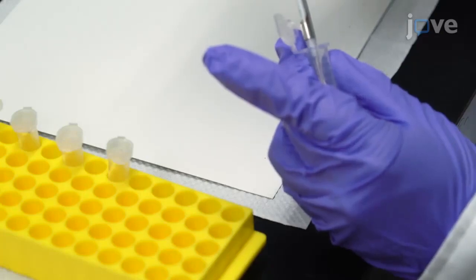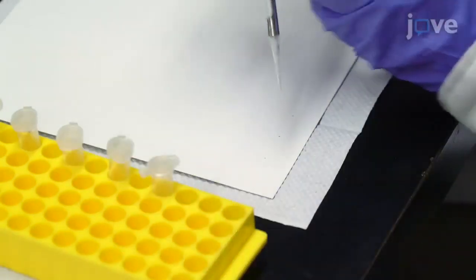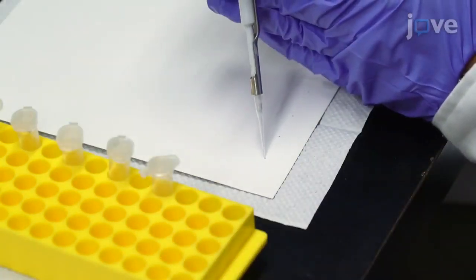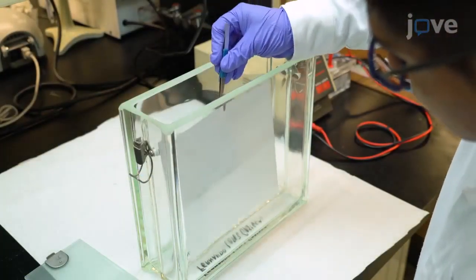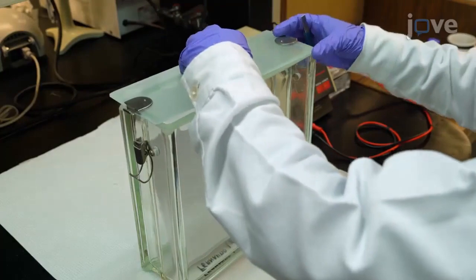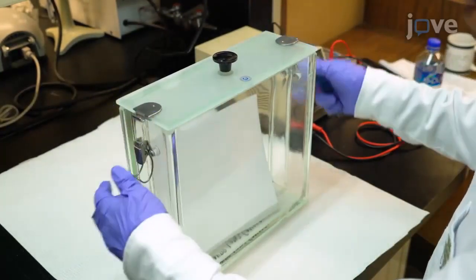First, apply 1 microliter of the previously prepared caffeine extract to the silica gel plates. Then, develop the TLC in the chromatography chamber with 10 milliliters of the mobile phase cyclohexane acetone.